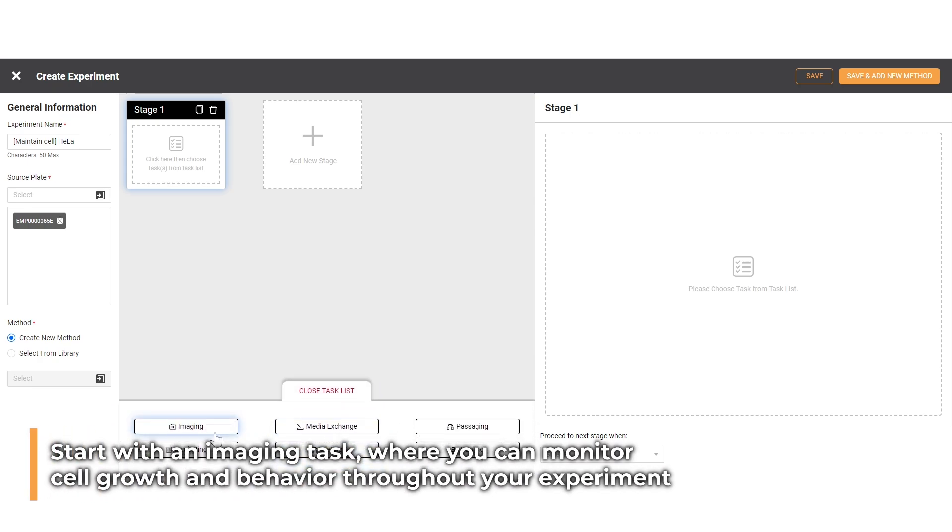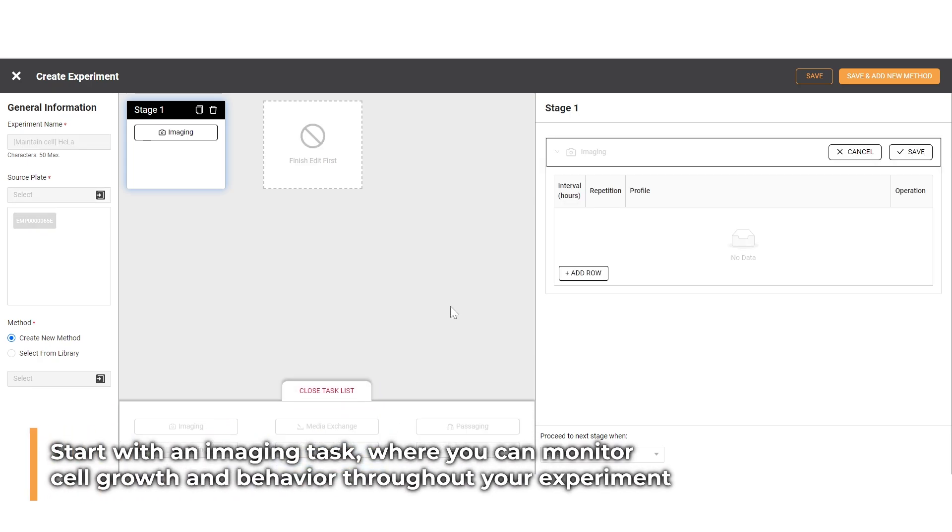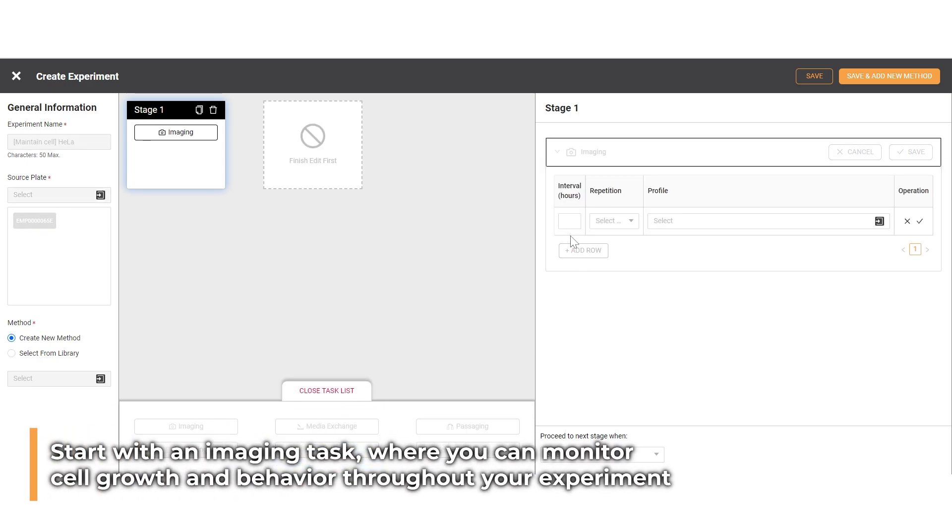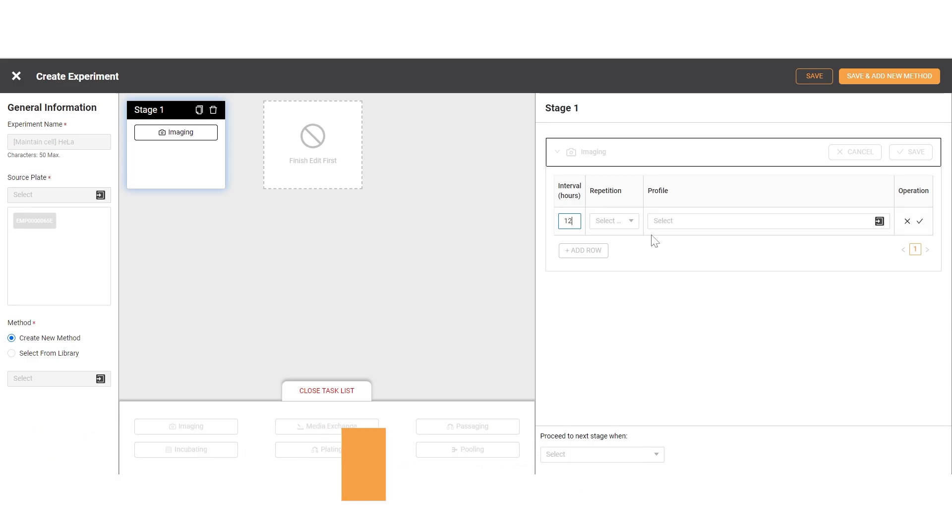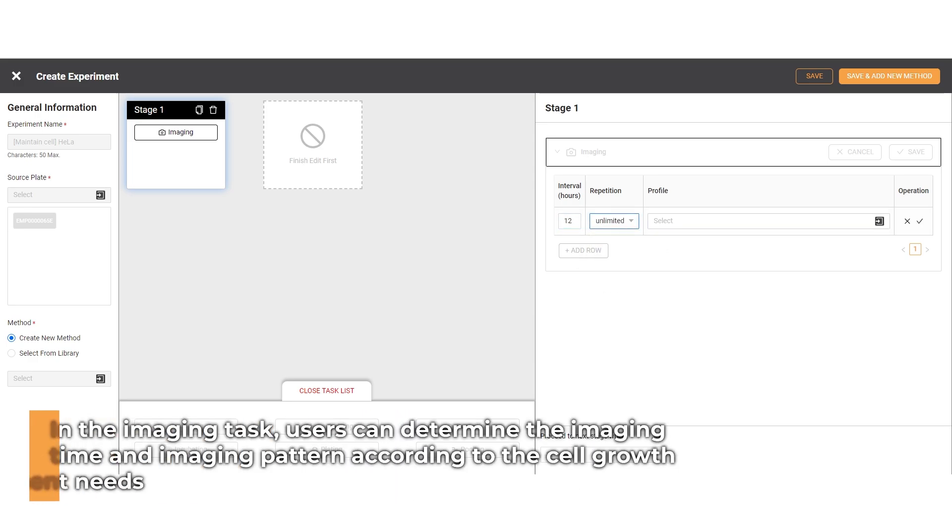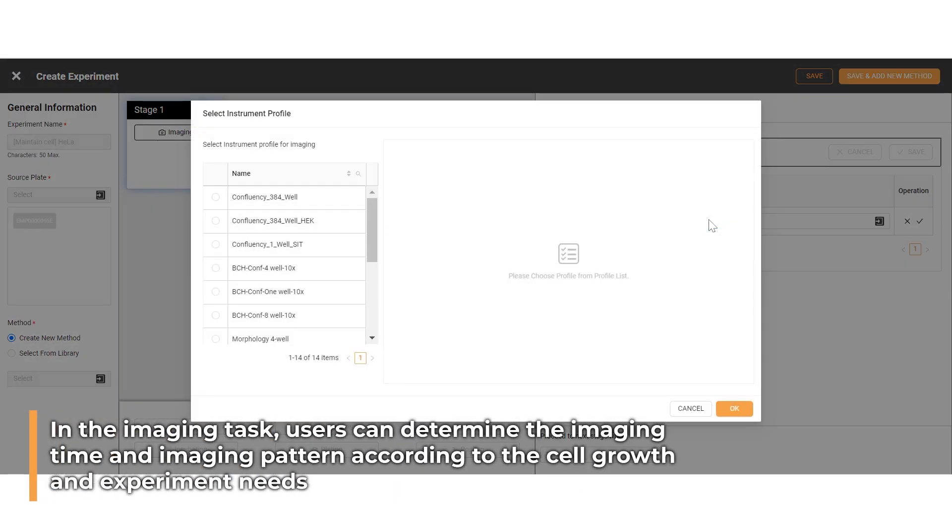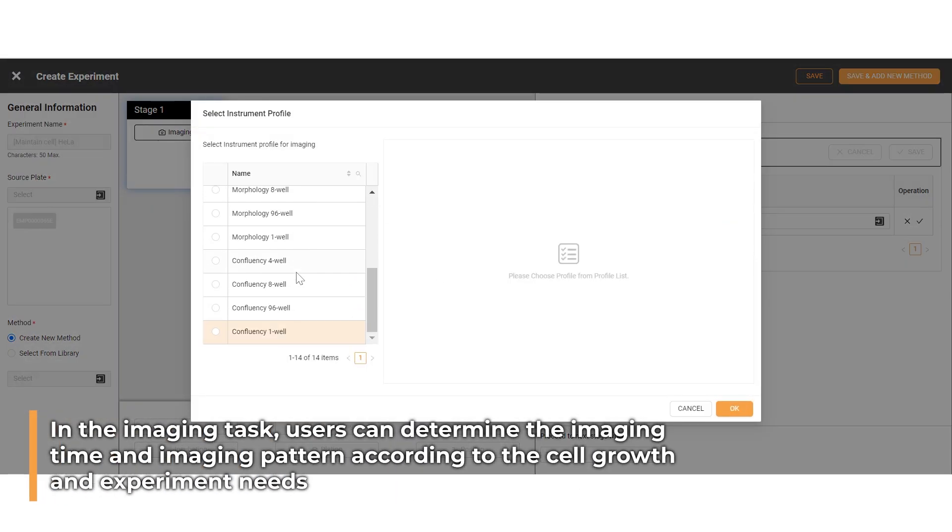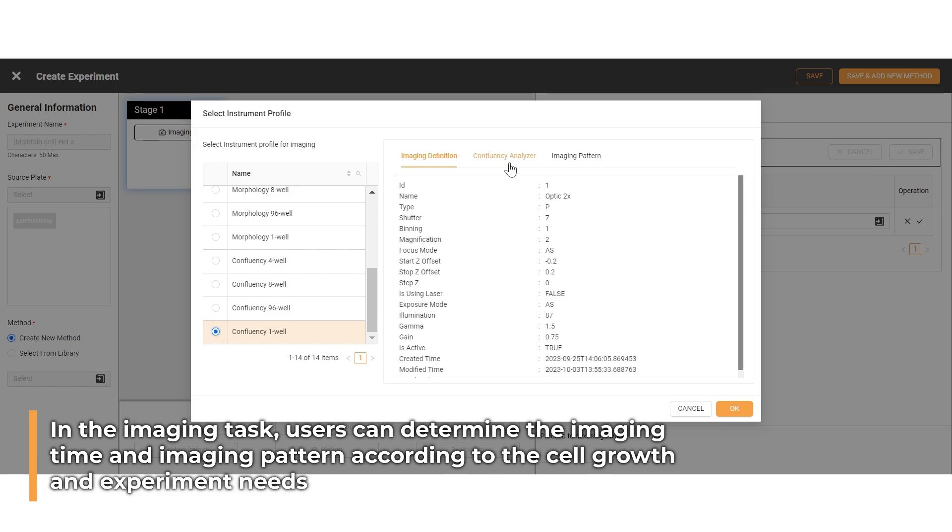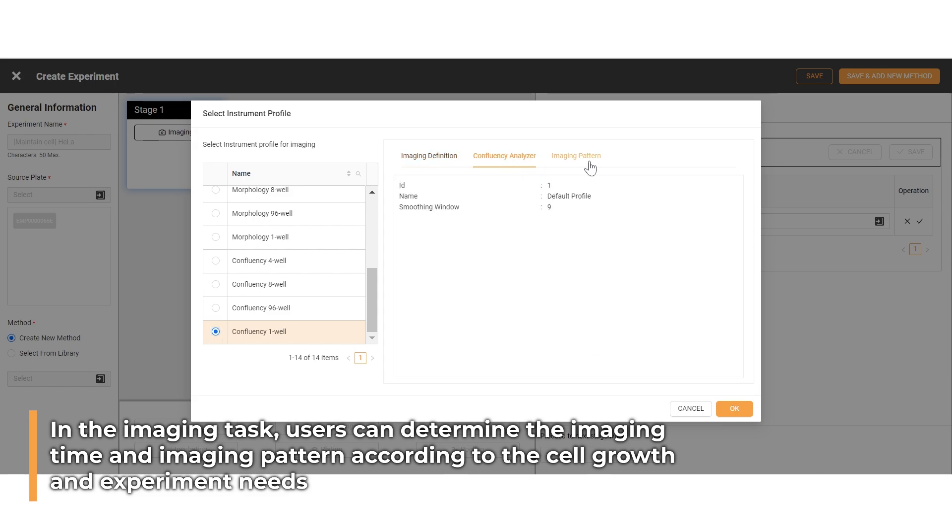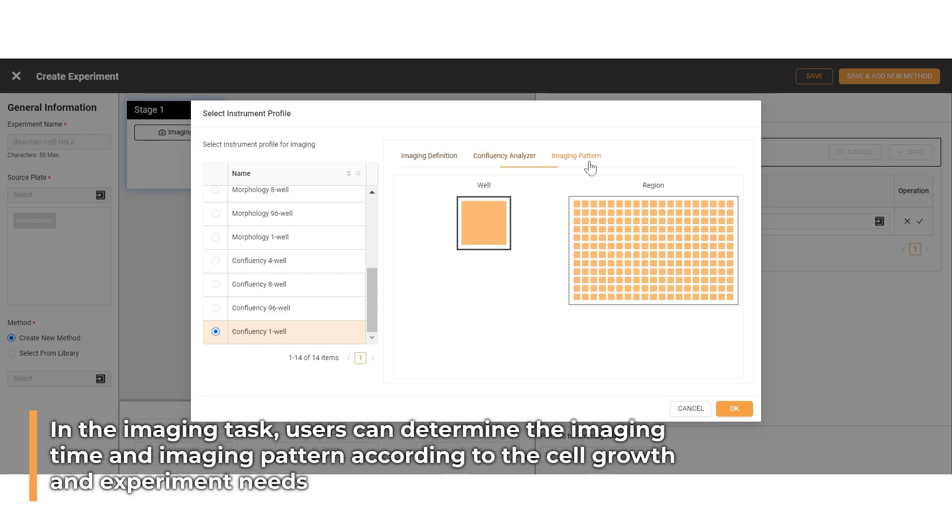Users can define their own experiment and select the specific task according to their needs. Start with an imaging task where you can monitor cell growth and behavior throughout your experiment. In the imaging task, users can determine the imaging time and imaging pattern according to the plate type.